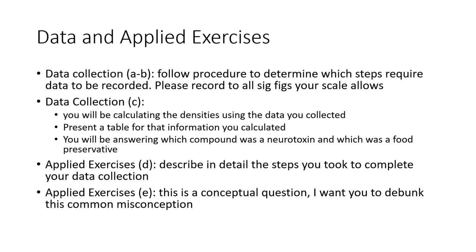For applied exercises, part D, you're going to describe in detail the steps you took. So just how I was narrating what I was doing in the video, you're going to do that, except you're going to write it out. And please be as detailed as possible. The whole point of me asking you to do this is so that I know that you know how to use Chem Collective, and I know that you did it yourself.